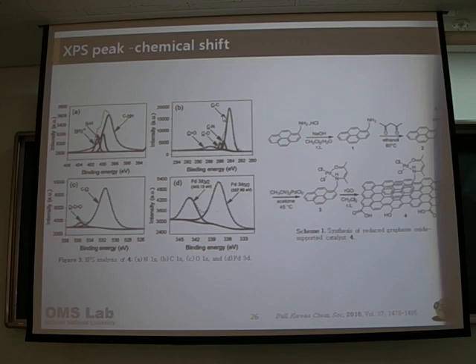Can you, 이거 왜 이러지? I cannot see your compound too. What kind of functional group do you have over there? This number 2 and 3 are almost similar. Without palladium, is that right? Yeah, this is palladium, with the imine. Is that right? Is that two? Yeah, O and the imine. NAs, yeah, and this is the chloride. So that means palladium chloride is inserted in this compound. Compound two. So the two is the imine and the ketone, right? Yeah, ketone is here.